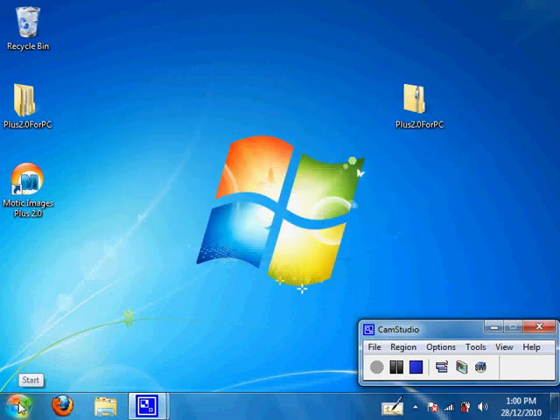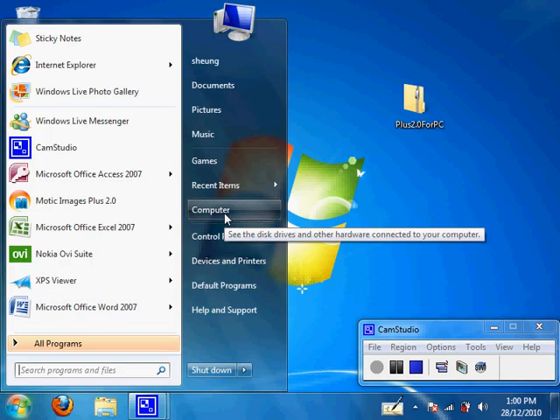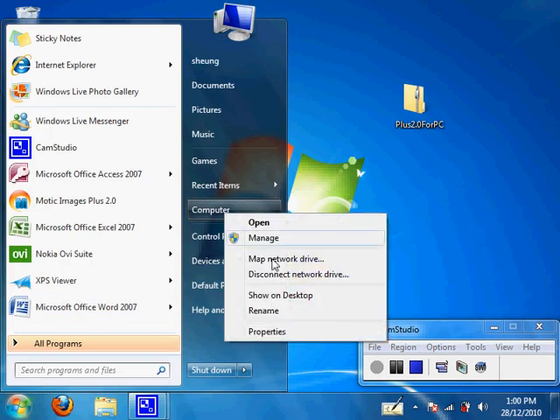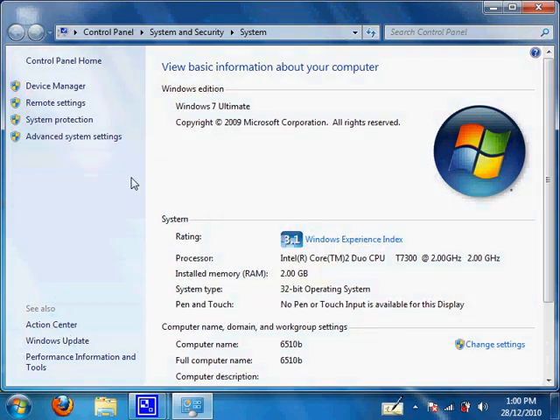Go to the start menu. Click on start menu. Right click on computer. Then click on properties. Then click on device manager.